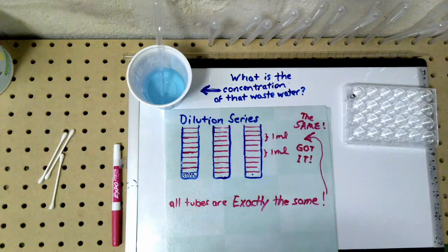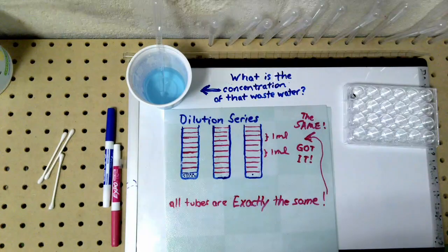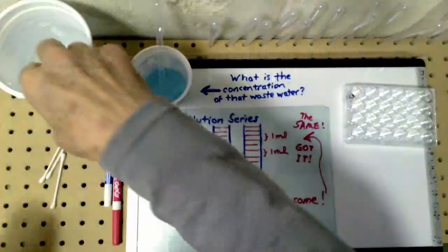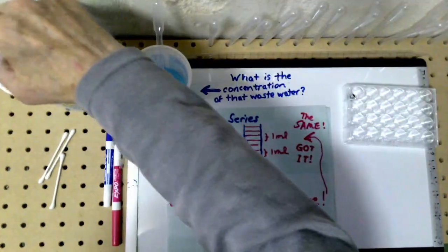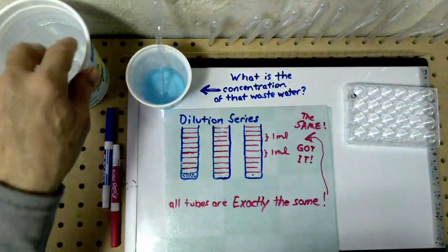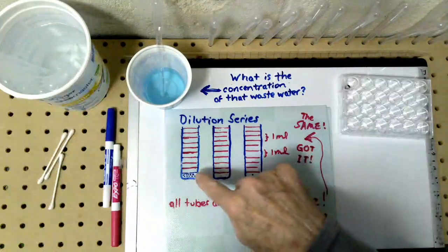To do that, we're going to add some water. Now, food coloring is water-based, so it's just like adding more water to it. We're going to talk in terms of drops, not milliliters, not gallons, not ounces, not tons. Now, here I have some water to add to it, and I'll do that in just a second. But before I add this water to that drop, let's talk about it right here.